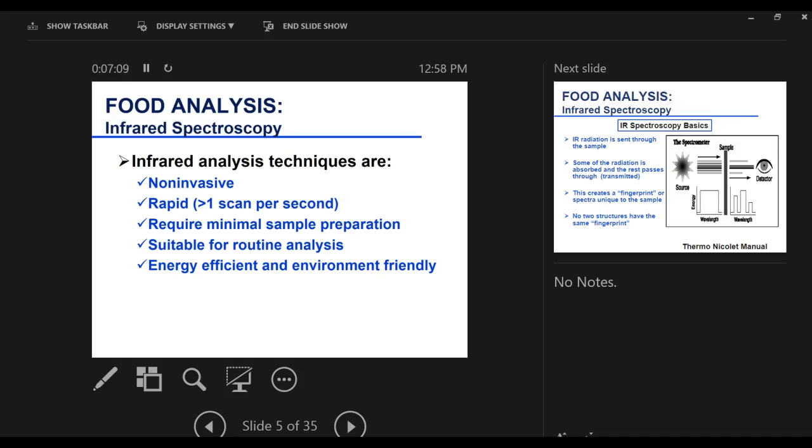Sometimes your sample will be as is. For example, I used to work in a flour mill and I used to collect samples during the milling of the flour, and I would just go and run it on the IR to determine ash content. The ash content is correlated with the level of bran in the sample. Was it refined to the level that we wanted or not? You put your flour sample in the cell and then do the measurement right away. Not much preparation.